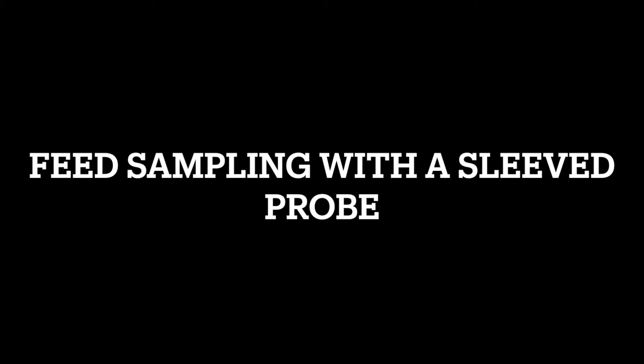In this video, we'll be talking about how to collect feed samples. We'll first look at how to take a feed sample with a sleeved probe.